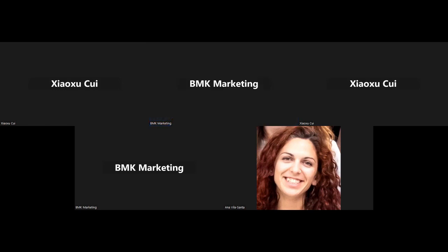And there is another question, this one is for metagenomics. In metagenomic studies with Nanopore, is it really important to also perform Illumina sequencing? Yeah, so I didn't address this so much during the presentation, but Nanopore is great because it provides long reads, but it has a problem with accuracy.